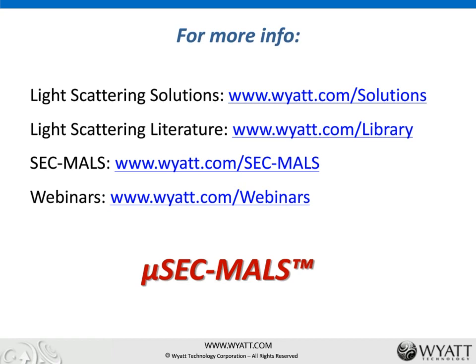So actually, again, you can find on our website the sensitivity specification for BSA is 70 nanogram loading on a 15 centimeter BEH column. So 70 nanogram for BSA at 67 kilodalton roughly is about, let's say, 35 nanogram for IgG, or 50 nanogram for 100 kD protein. So now if it's for 1K, it's 100 times less in molecular weight, which means we need 100 times more in concentration. So for a 1 kD peptide, the minimum loading would be 5 microgram.